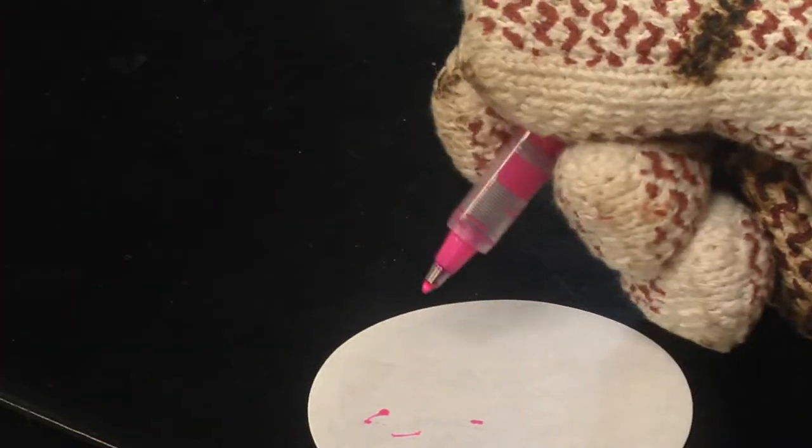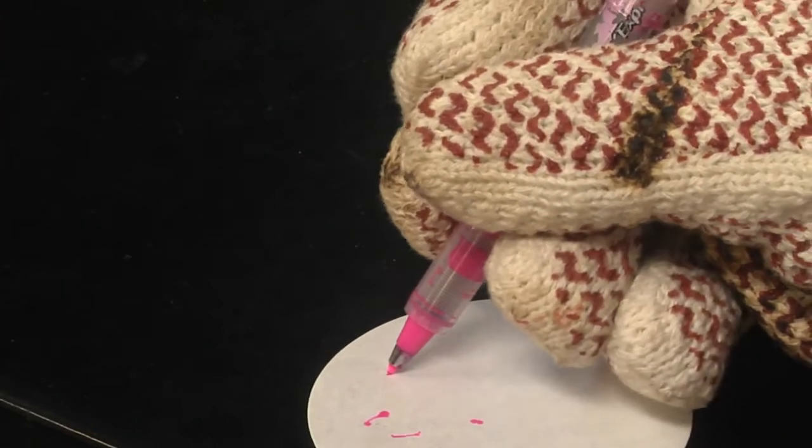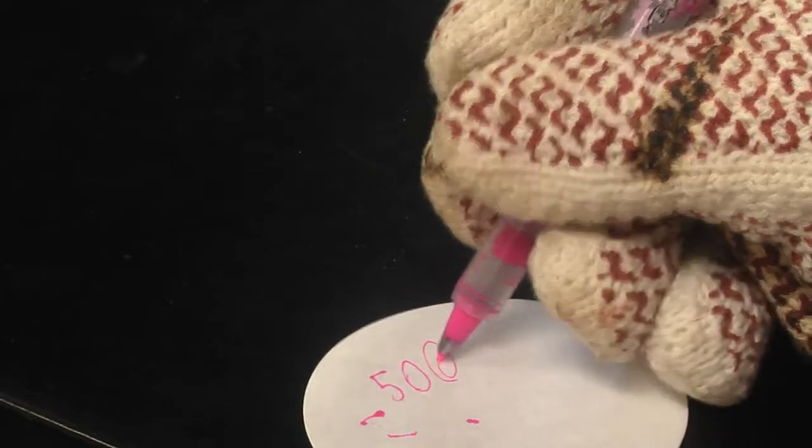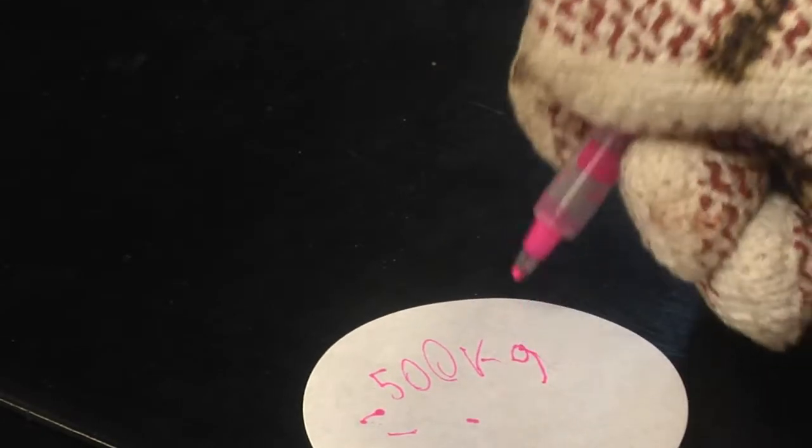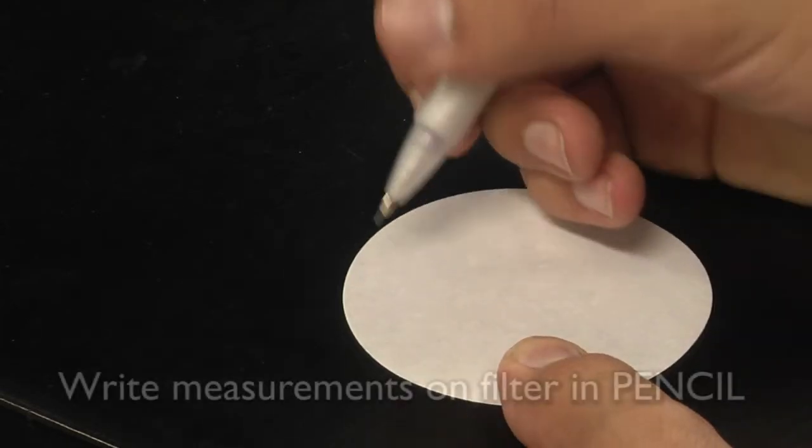Weigh out and label three filter papers. No, Dan, not in pen, because when pen gets wet, it runs. You want to weigh them out in pencil.